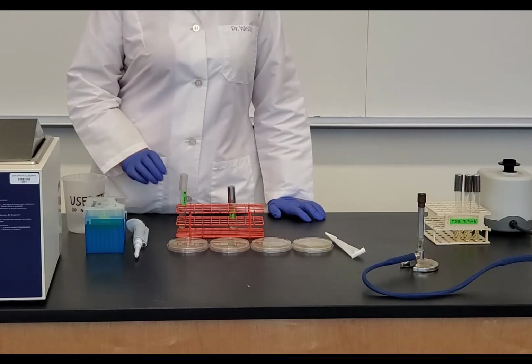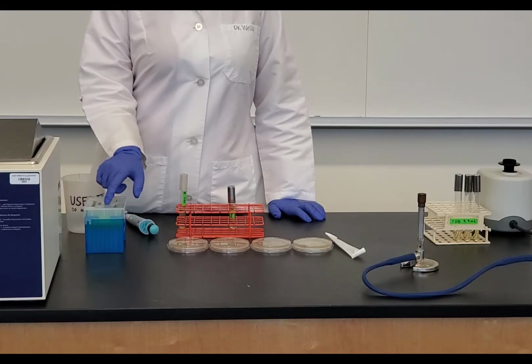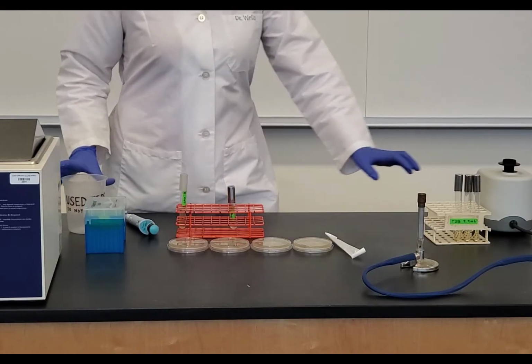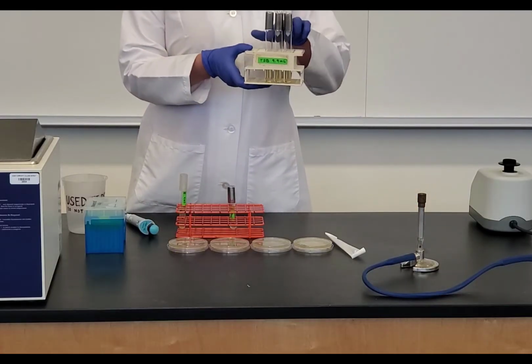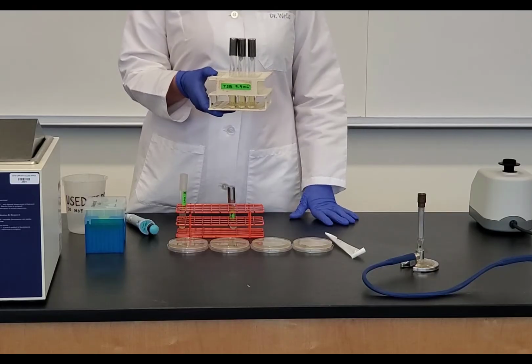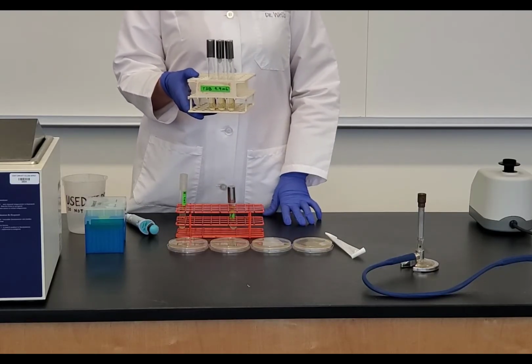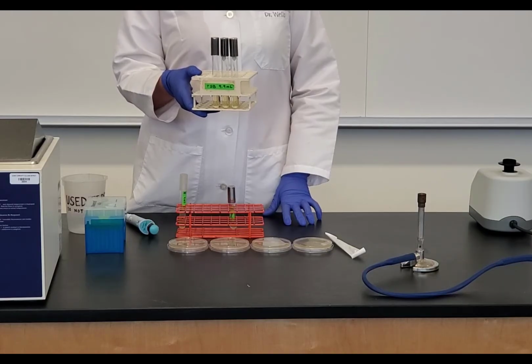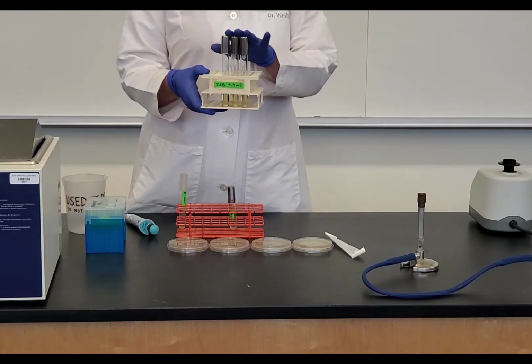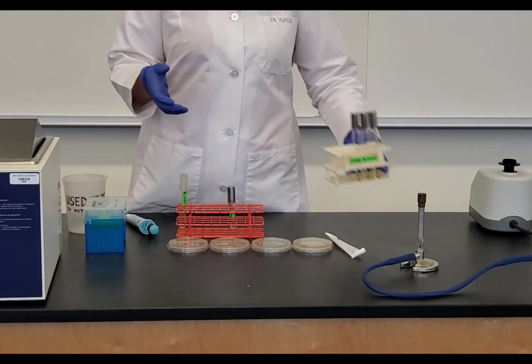So we need our phage solution, we need our E. coli solution, we need our micropipetters again, we need our micropipette tips, we need a used tip waste container, we need 3 tryptic soy broths, and these tryptic soy broths are what we are going to use to do our serial dilution. Just like we did a serial dilution for the standard plate count, we are going to repeat that process, but with the phage. We're going to do a serial dilution with the phage. So we have these 3 tryptic soy broths. This is what's going to be used for our dilutions.